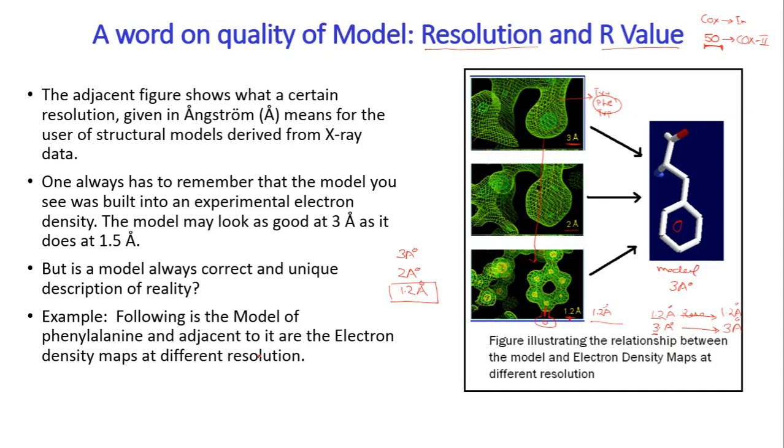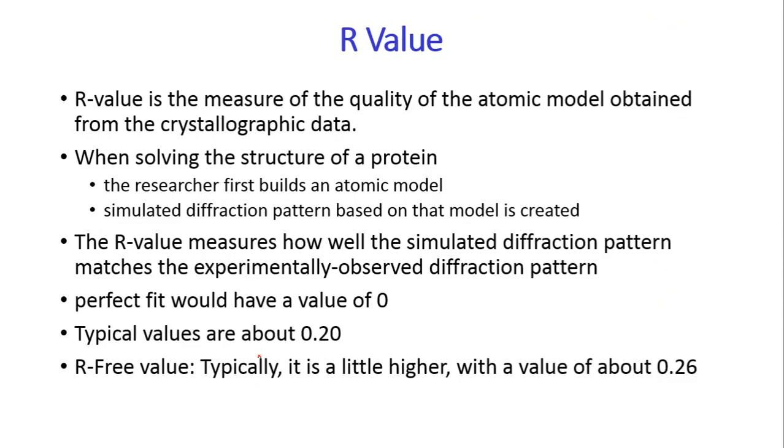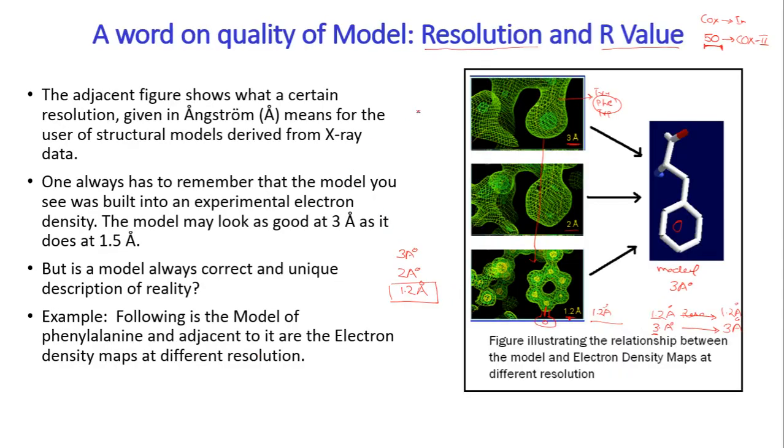The lower the value for resolution, it means that the protein has been resolved properly. That is what the idea is. Okay, so this is one way you can judge the quality of the model, on the basis of resolution.